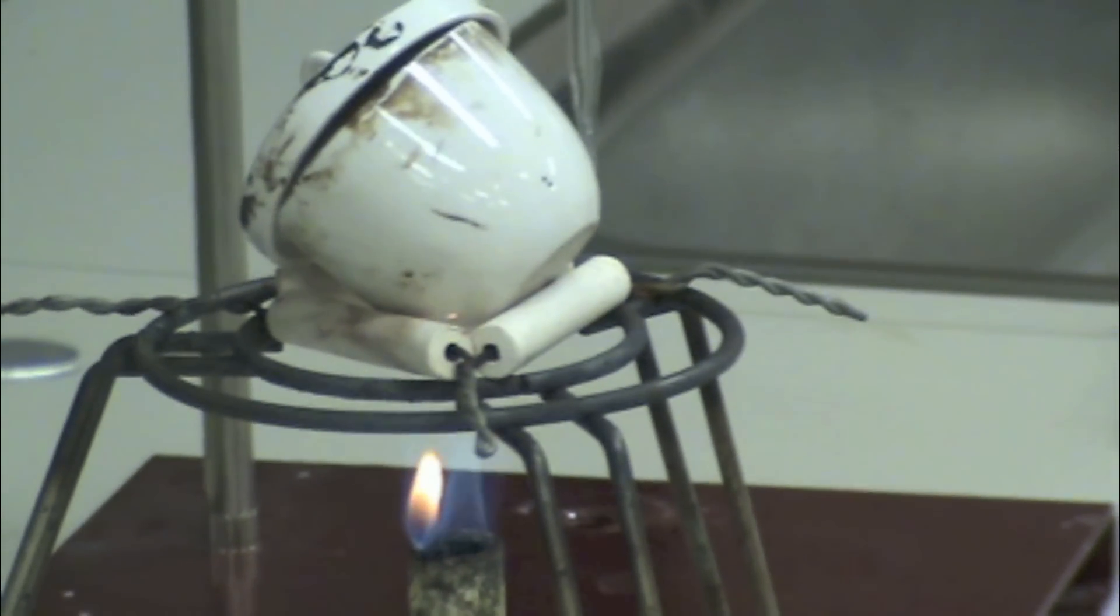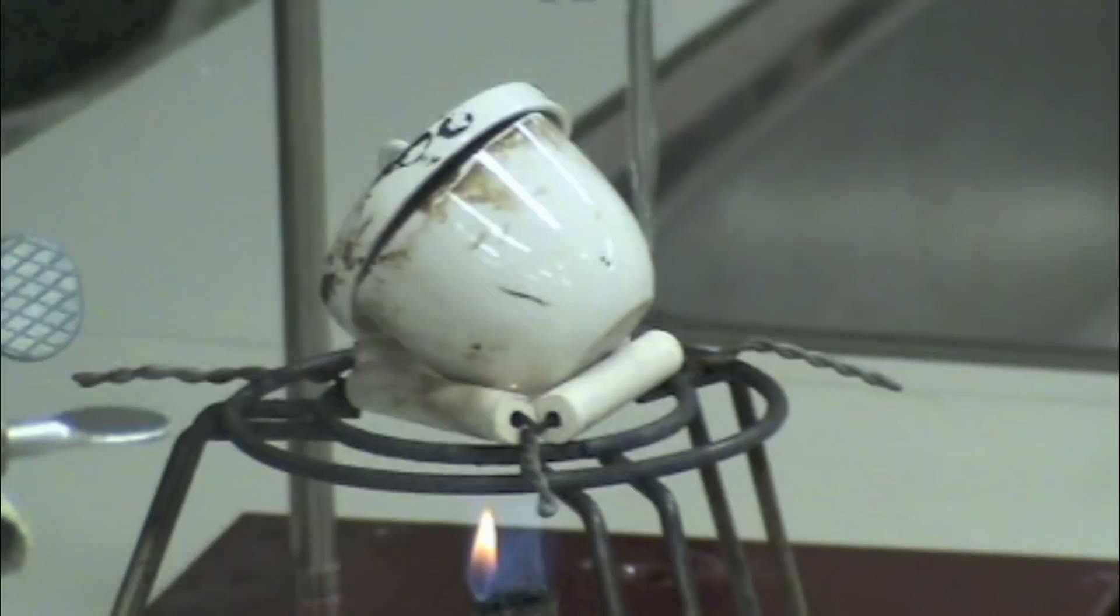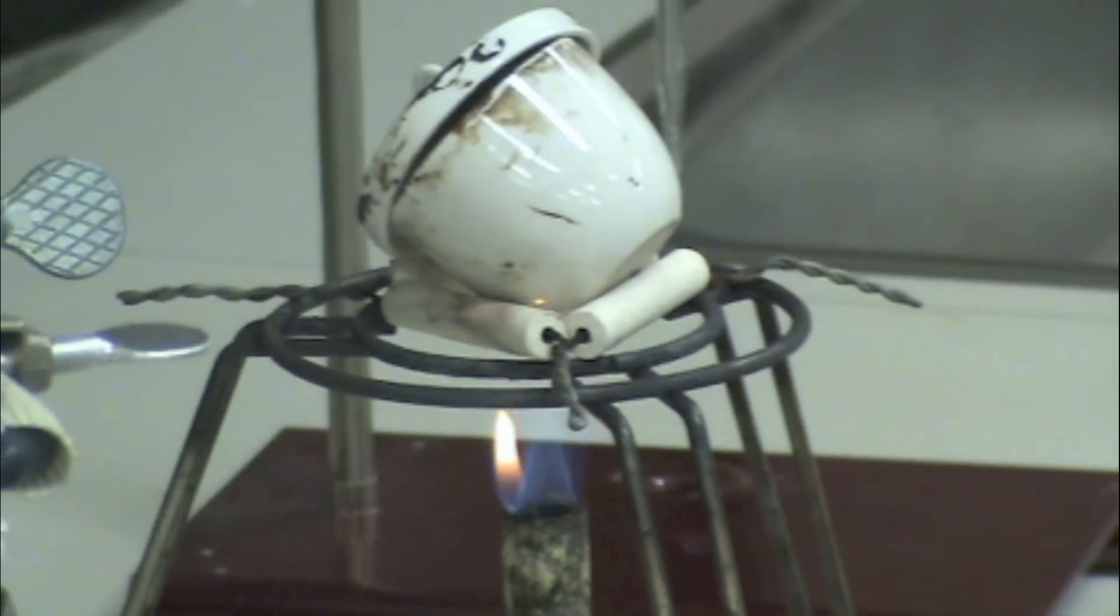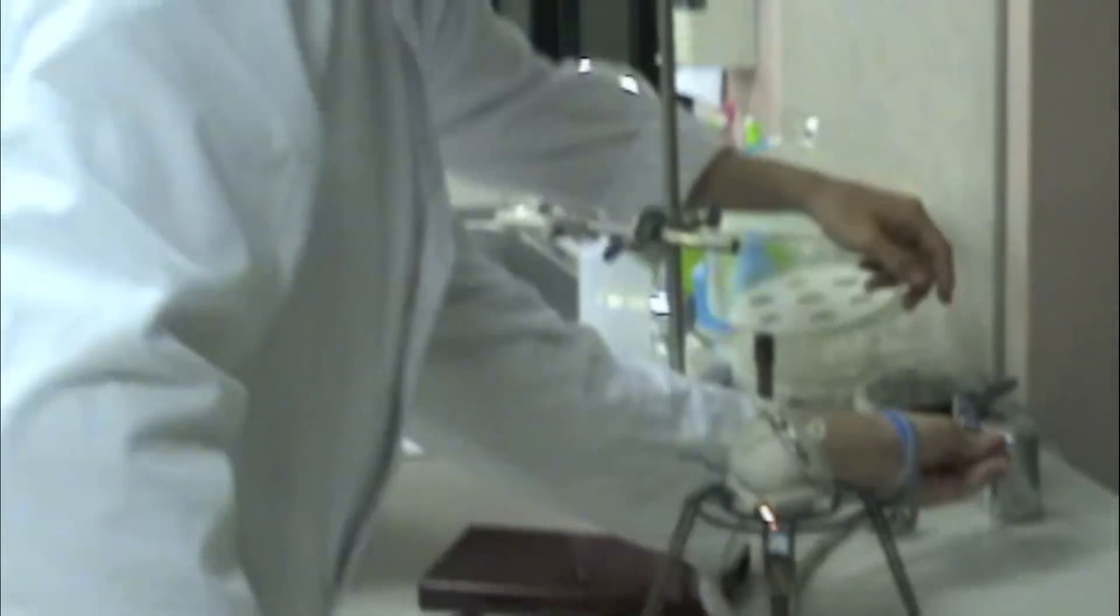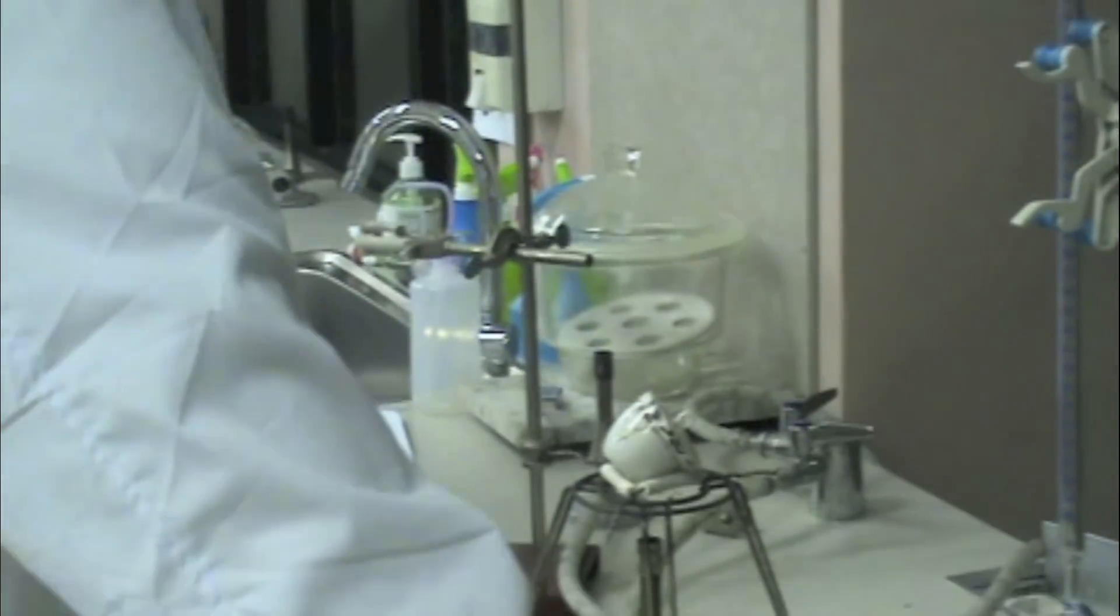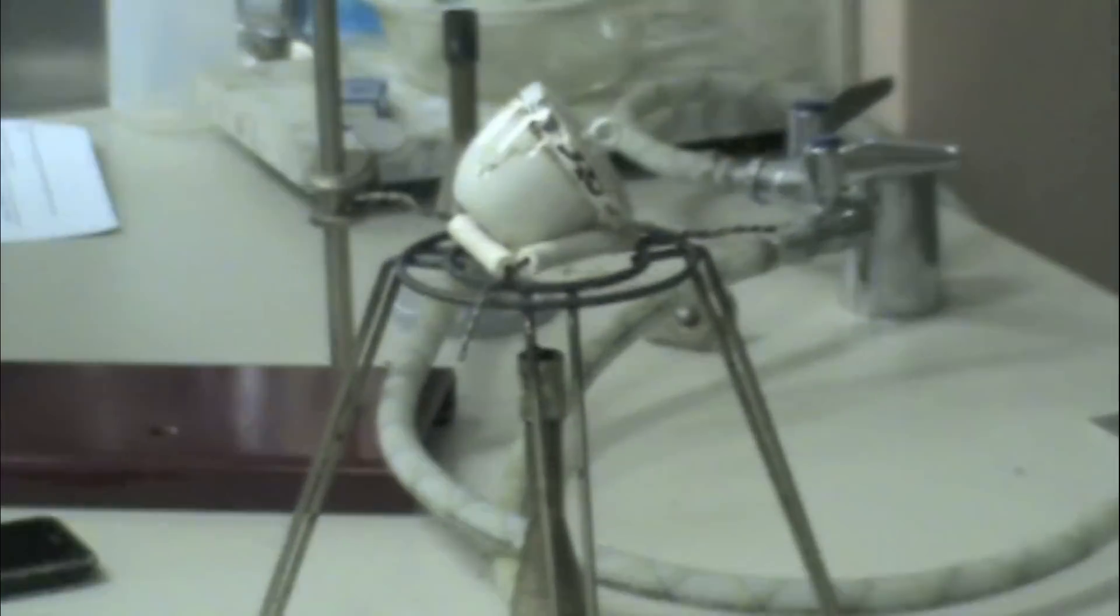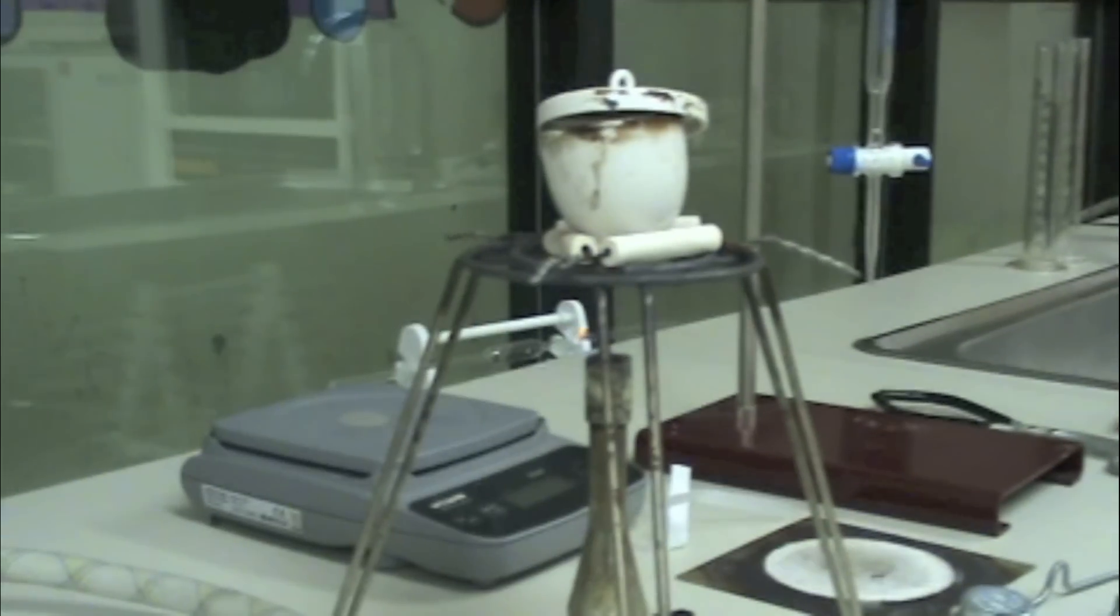While heating, don't forget to keep the lid slightly ajar so that any gas made from the reaction can escape while splattering from the crucible is blocked. As for the time of the heating, some reactions require more heat than others and so need more heating time. Still, try about 10 minutes or so, or more if your reaction needs a lot of heat.